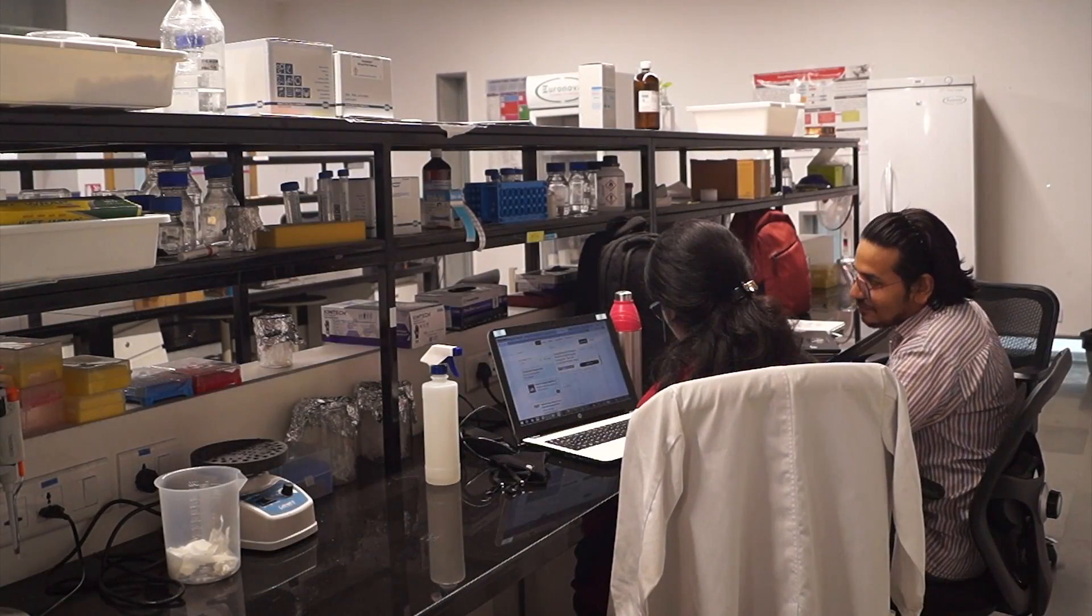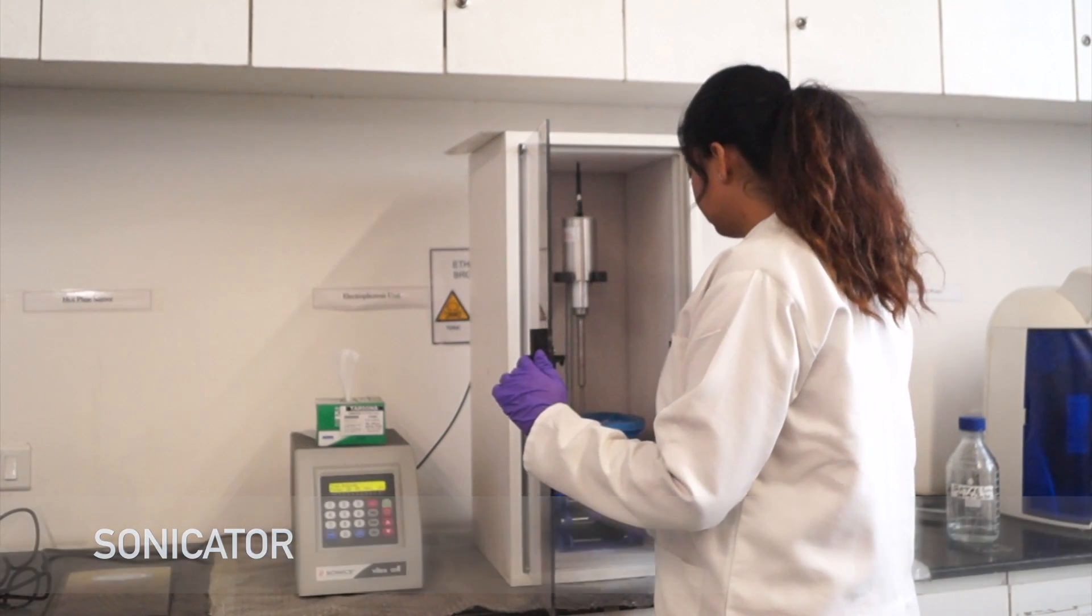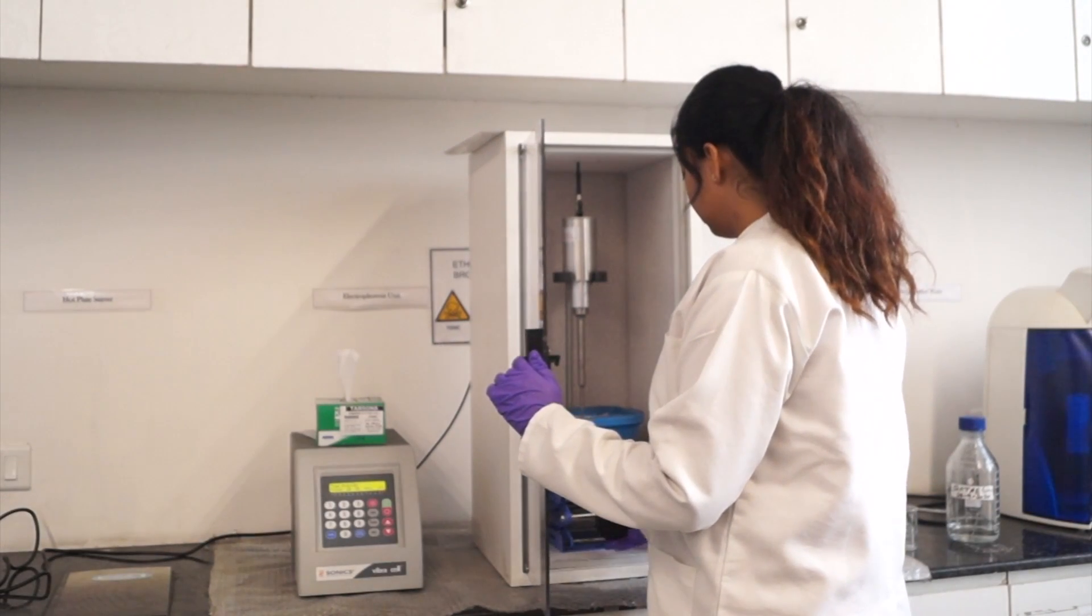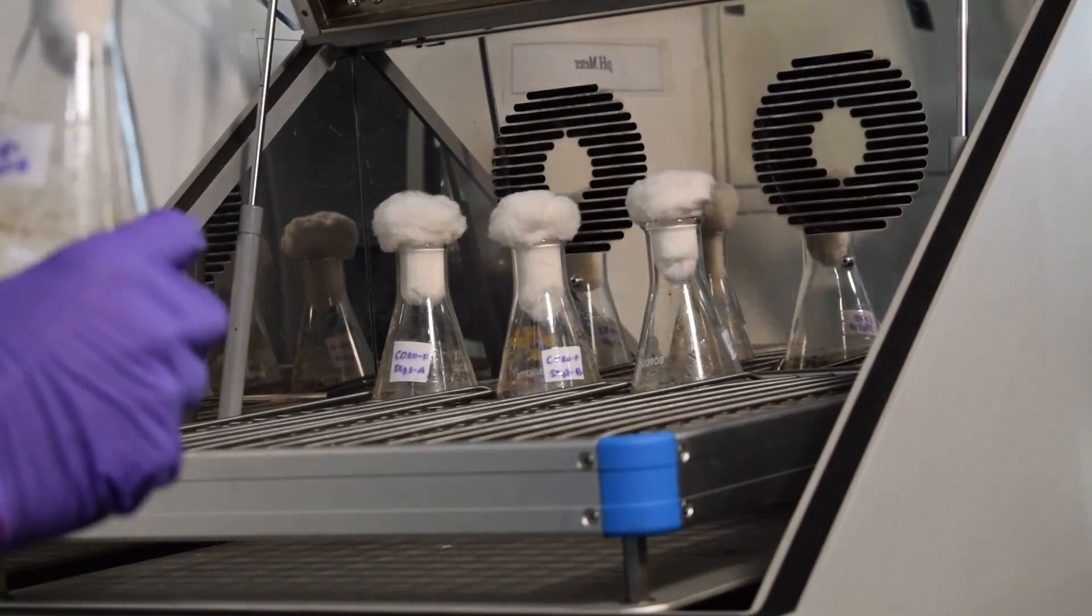The university excels in providing conditions for cell growth as labs here are equipped with sonicators and agitators which are necessary to incorporate oxygen and distribute nutrients throughout the culture media.